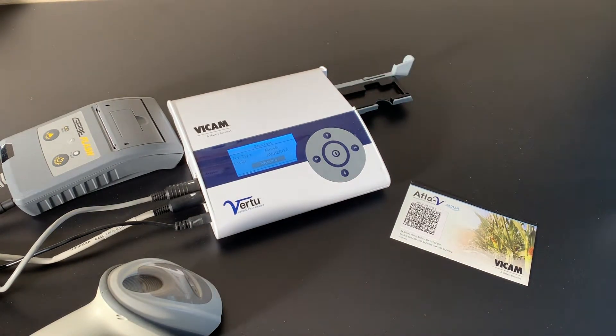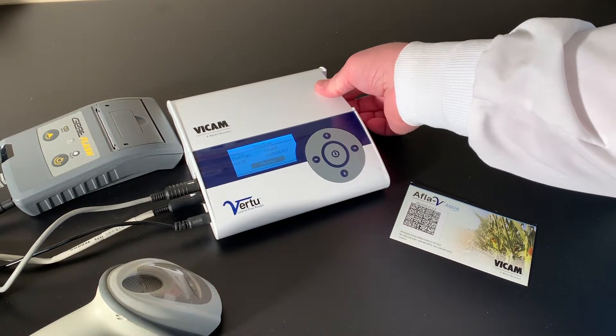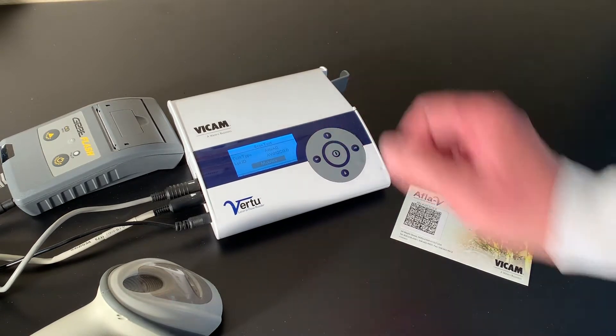This card is unique for every lot of strips. Place the strip inside the Virtu reader, the round opening facing inwards. Press the center button.